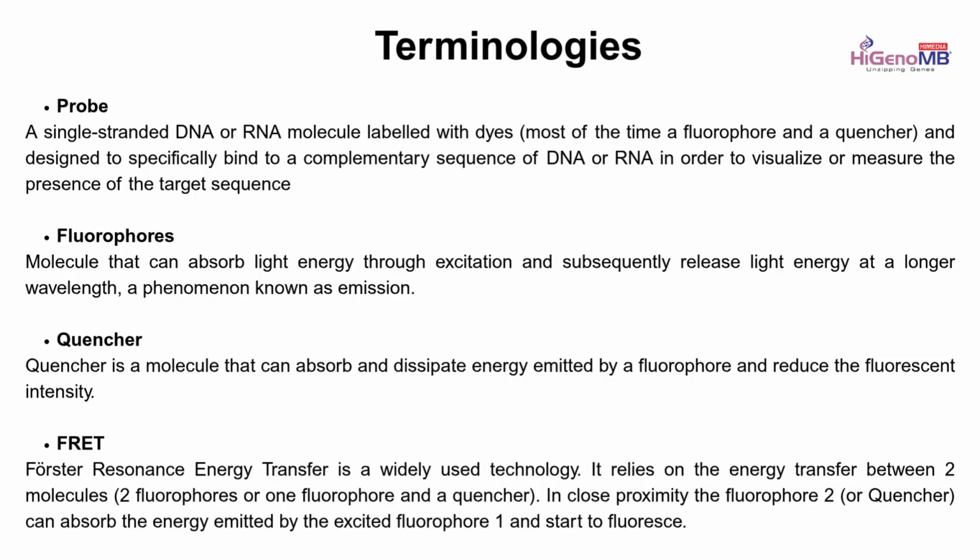Okay, these probes have fluorophores at their 5' or 3' end. So what are these fluorophores? These are the molecules that can absorb light energy through excitation, and they release the energy at a longer wavelength by a phenomenon known as emission.